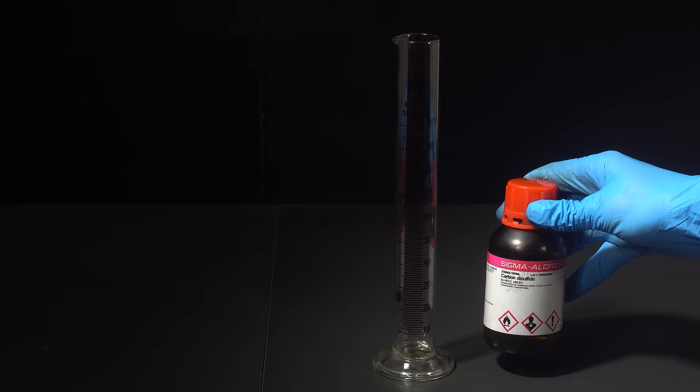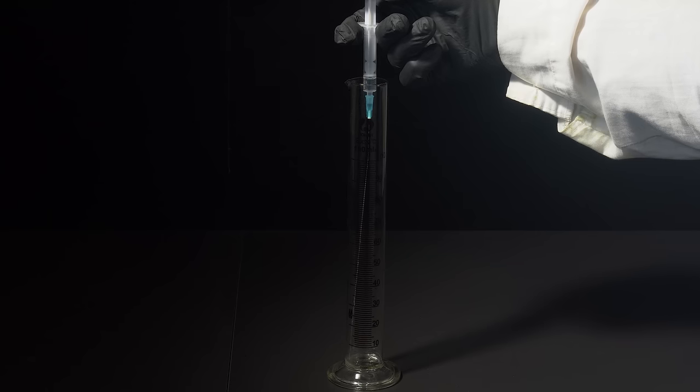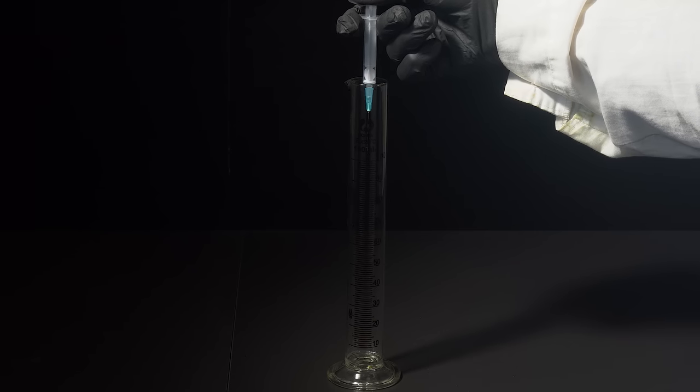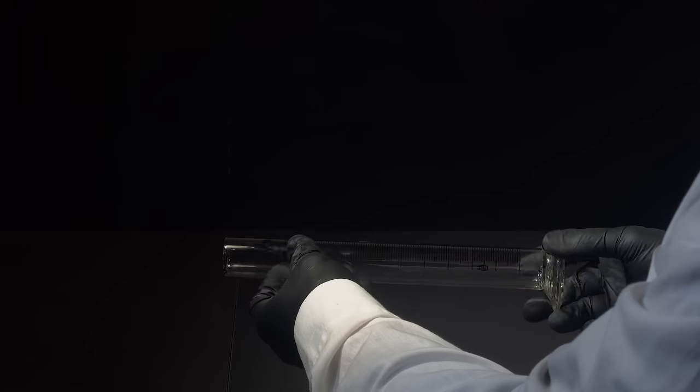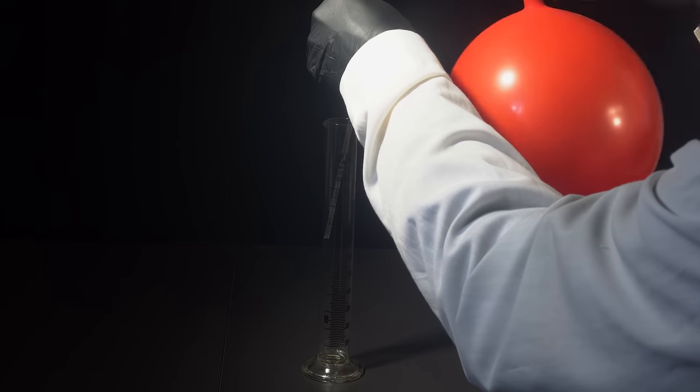Hey guys, in this video I'm going to show you a dangerous explosive version of the classic barking dog chemical reaction. The classic version is performed by adding some carbon disulfide and nitrous oxide into a long and narrow vessel, like a graduated cylinder or a test tube.